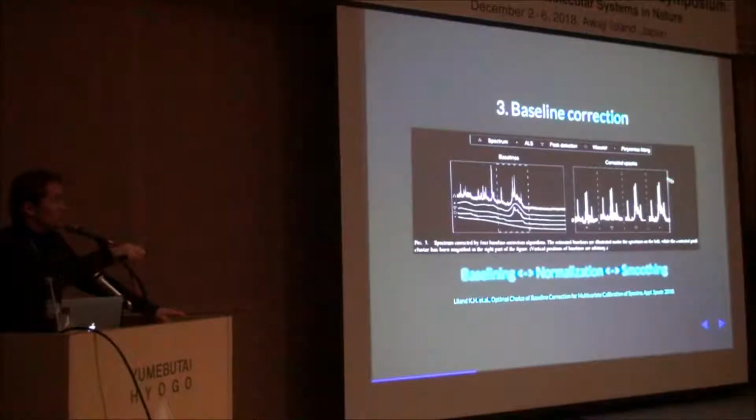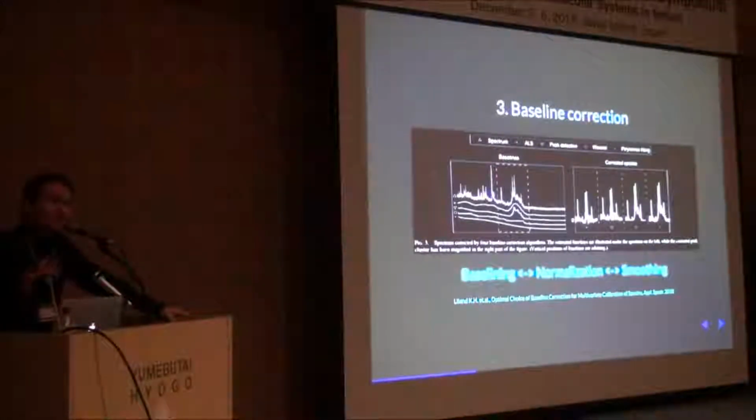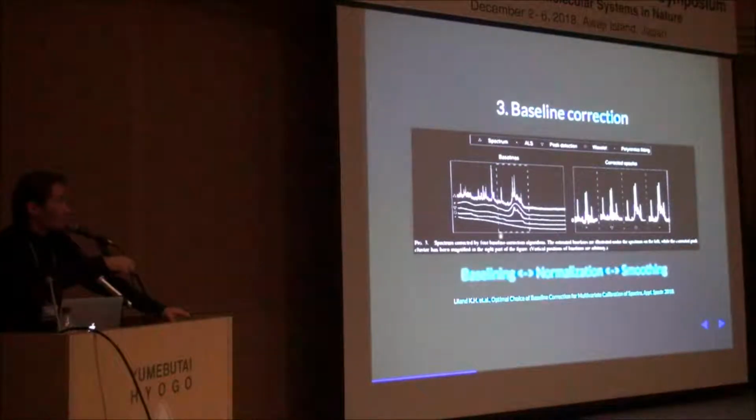Of course, this is a regular paper, so they take a few methods, they compare prediction accuracy, and they proclaim the winner, which method is doing the best. Probably the one they're proposing is doing the best, but many times there is a very, very small difference, and who knows what's going to happen in a different sample. But okay, let's go along with the story. I just want to tell you that from experience, I'm positive that polynomial fitting and wavelet can create all of these results. So the result that you see here is not unique to that technique.